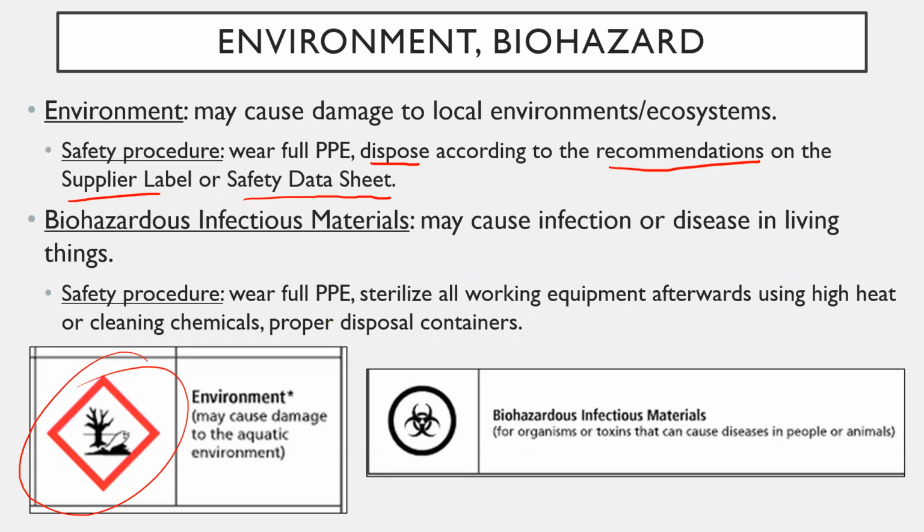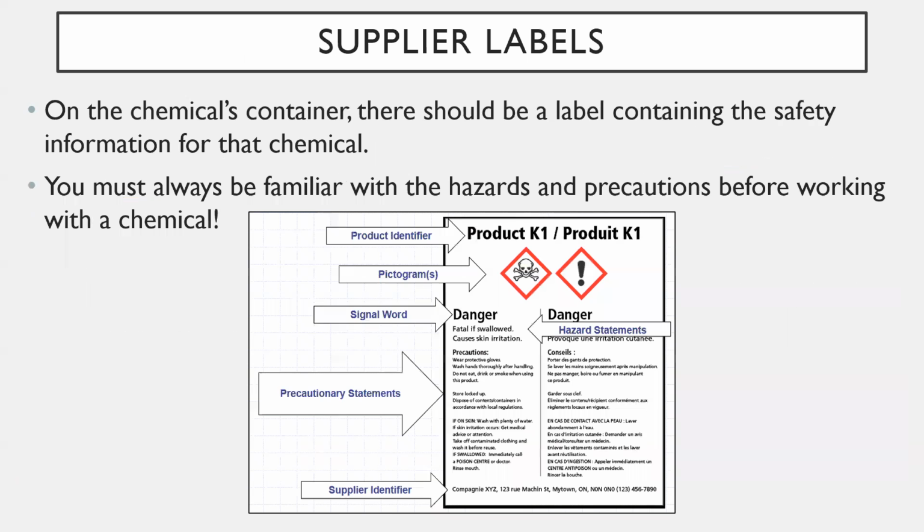And you also have to make sure you're not getting any infection or any disease from working with that thing, right? Again, biohazards, we're not going to work on that in Science 9, but it is still important to know. The symbol is pretty hardcore looking. It looks like a bunch of C's that are all stitched together. That's a pretty unique one. It's kind of a hard one to remember, but again, you are expected to know it.